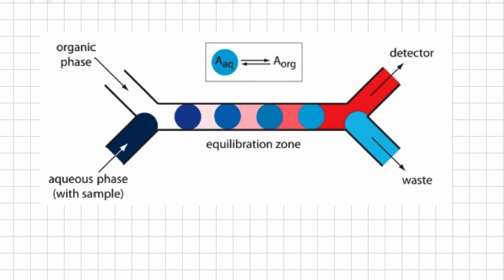So in this way, by incorporating separation modules using the semi-permeable membrane, and by using liquid extractions, we can also do separations. These separations are not complete, but they are reproducible, which is of great advantage. So this was all about the instrumentation, the different components and the working of the individual components that are used in a particular flow injection system.